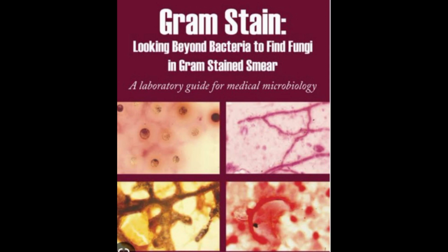Tissue: bone marrow, biopsy materials, endometrium and surgical tissue. Instruct to collect the specimen in a sterile screw capped test tube containing 5 ml sterile normal saline. Semen: instruct the patient to collect in a sterile wide mouth container. Reagents: microslides, sterile normal saline, diamond marker, tissue paper, gram stain, immersion oil. Equipment: autoclave, biosafety cabinet, microscope.